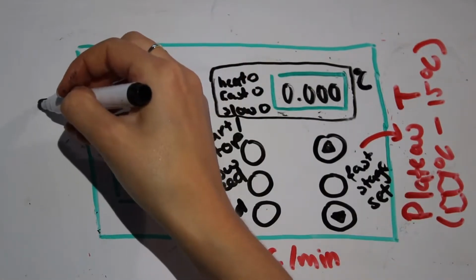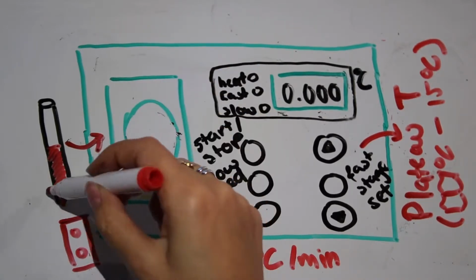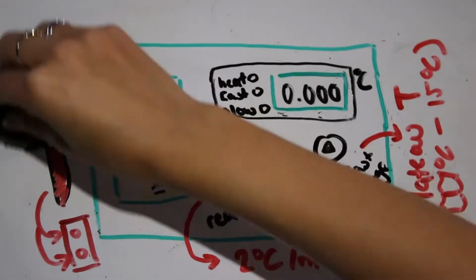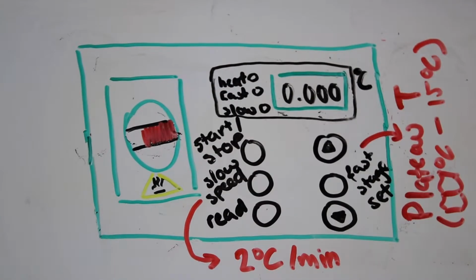Prepare a capillary tube with your sample and place it in the machine. Press Start on the machine. The unit will heat up until it starts beeping. Press Start again to stop the noise before others around you get slightly annoyed.